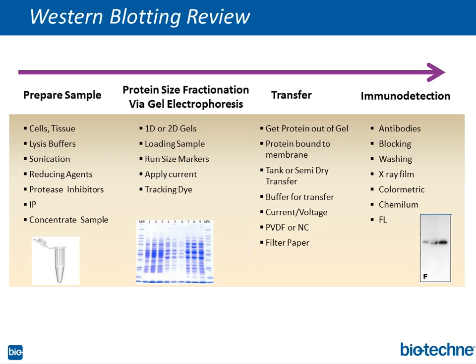A lot of people are using agarose beads for IP, where you have to do a lot of pipetting of the beads, and sometimes when you're taking off your supernatants from the beads, you'll lose some beads, and that's protein you're losing. And so a lot of people move to magnetic beads. So that's another thing you could think about to try to maximize your protein recovery.